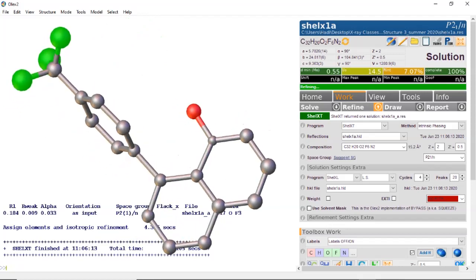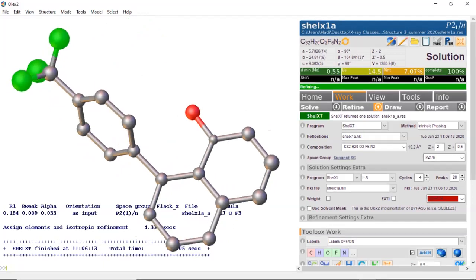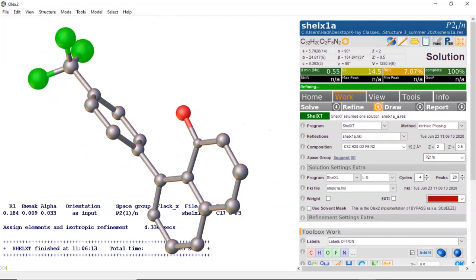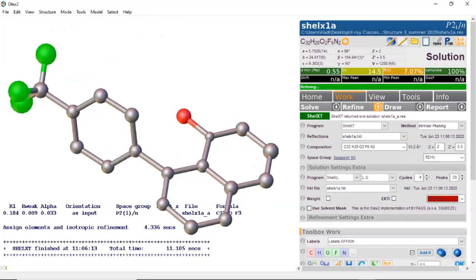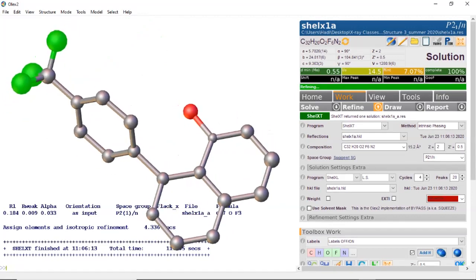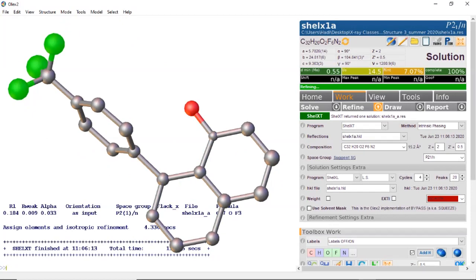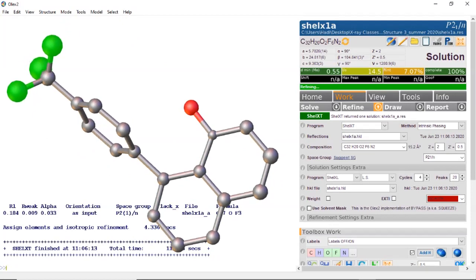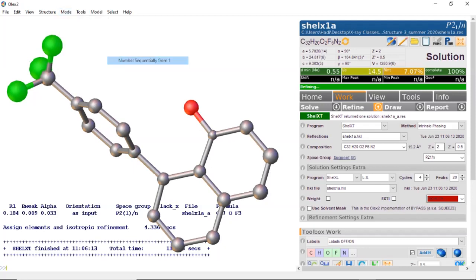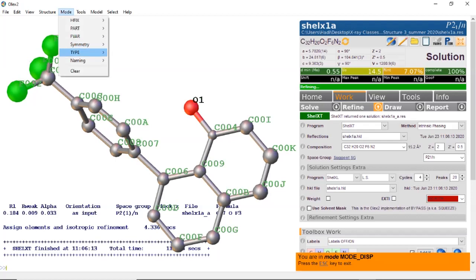Here is the initial model that was solved. This is an N-oxide, so we have a trifluoro group, a naphthalene ring, and the oxygen off of it. It looks like it did a pretty good job of doing an initial solve model for this structure. If we want, we can go ahead and name the atoms — I'll do that now using mode naming.